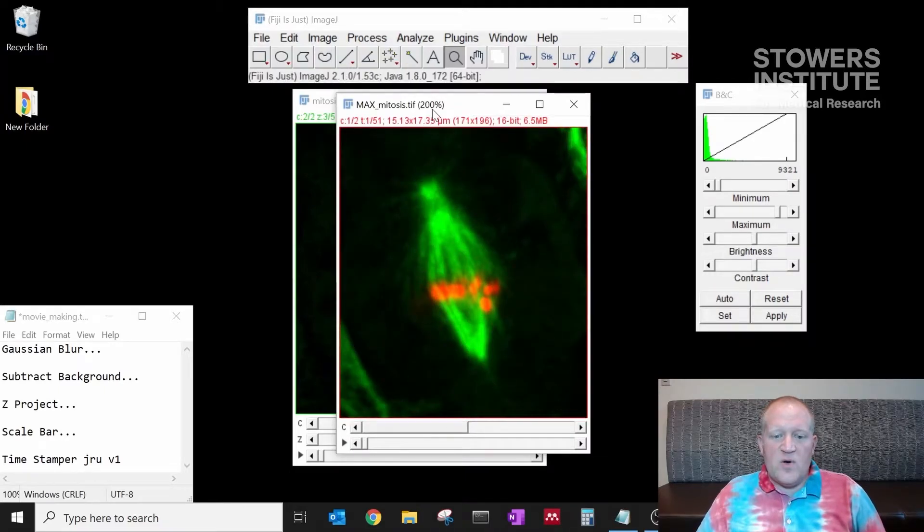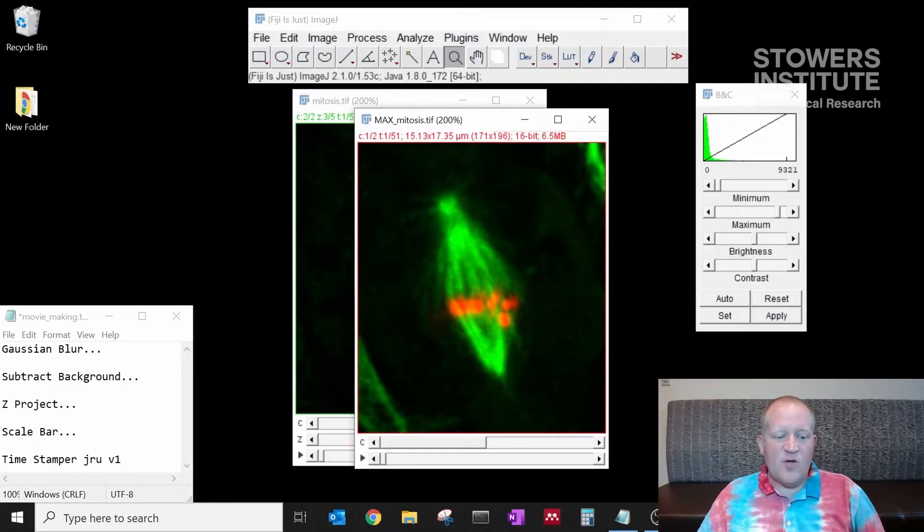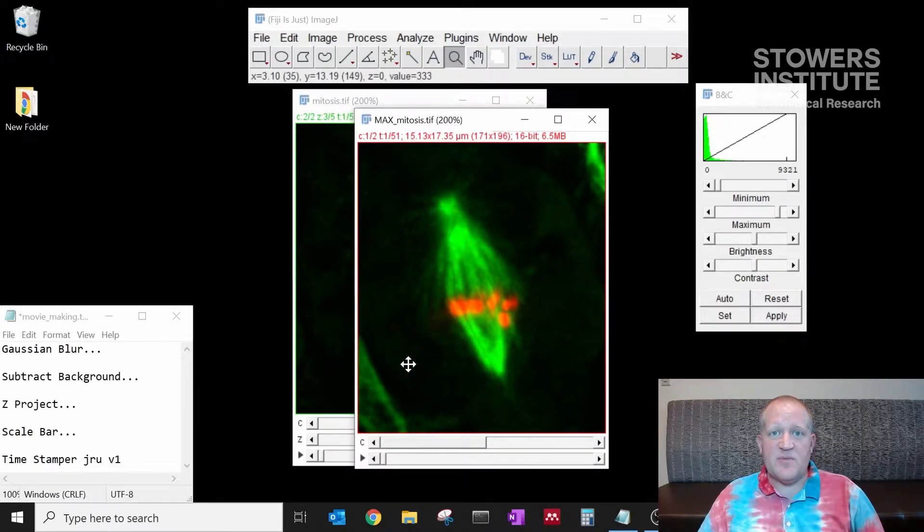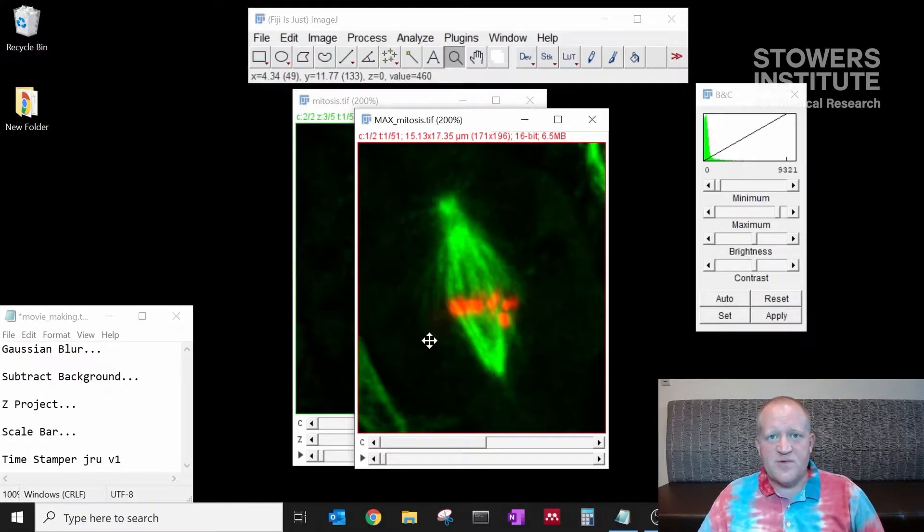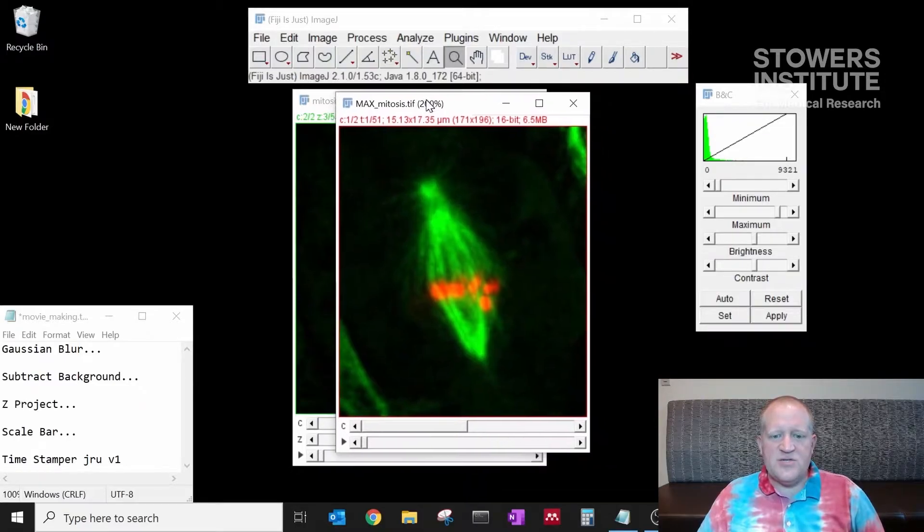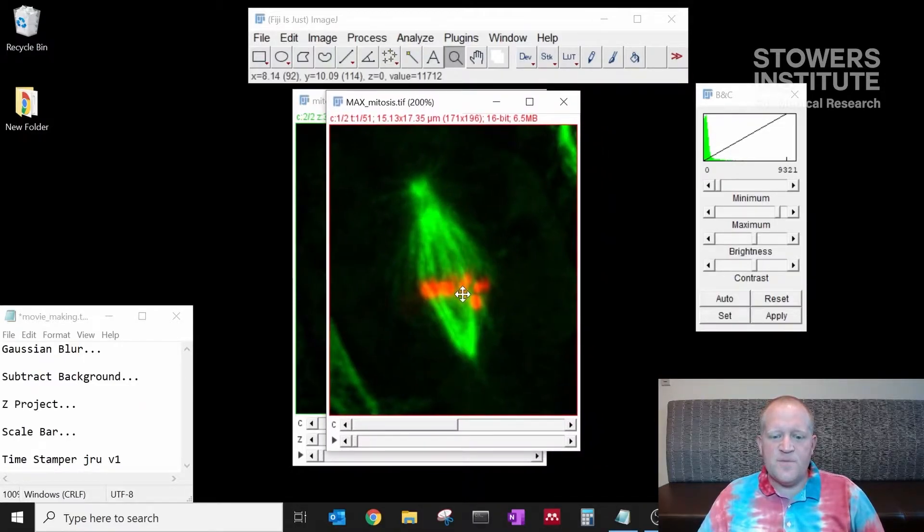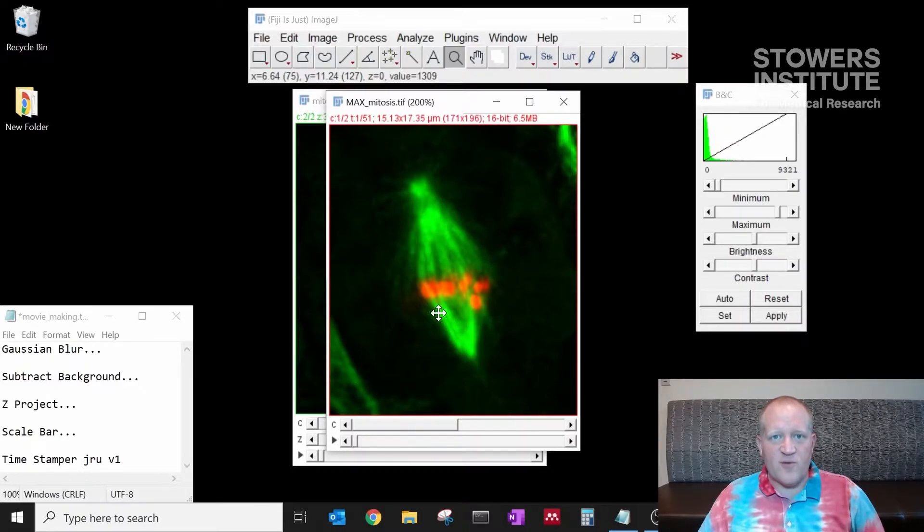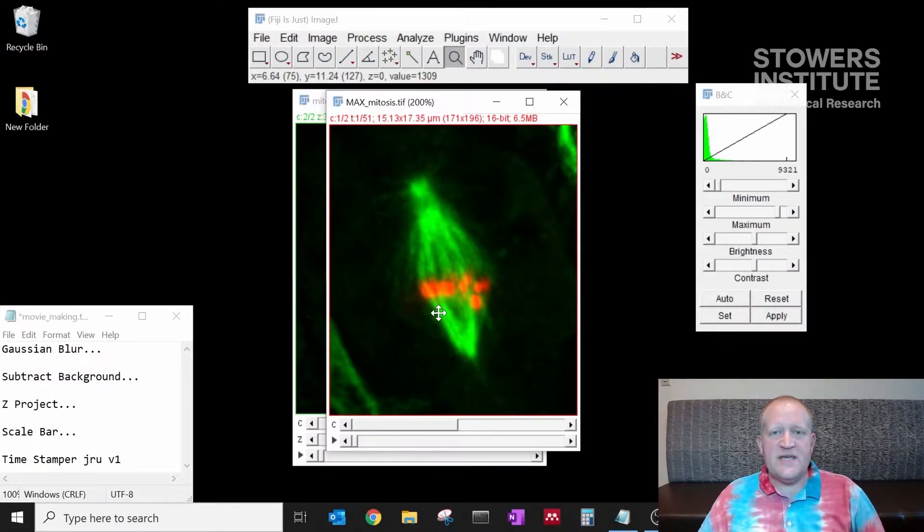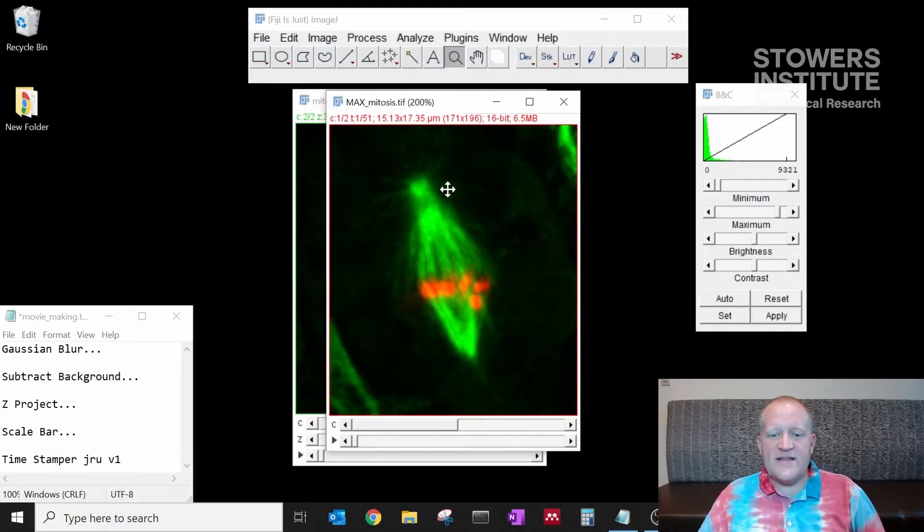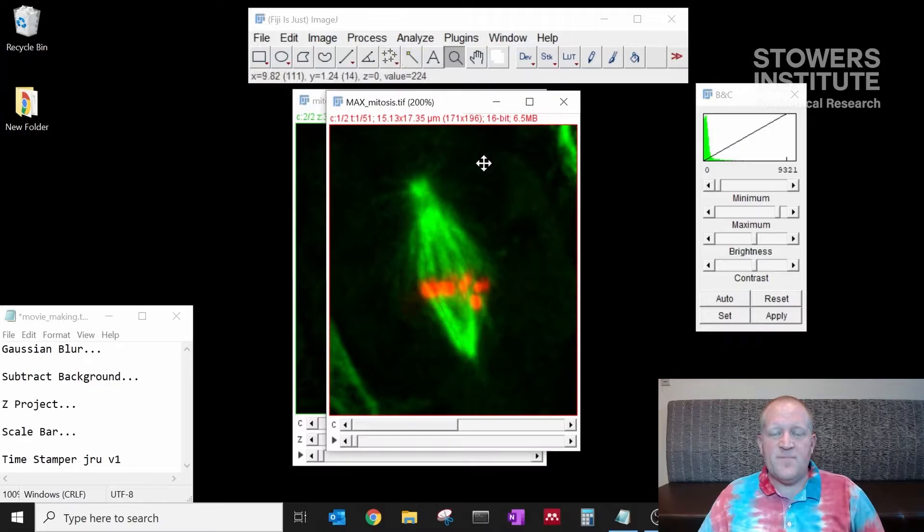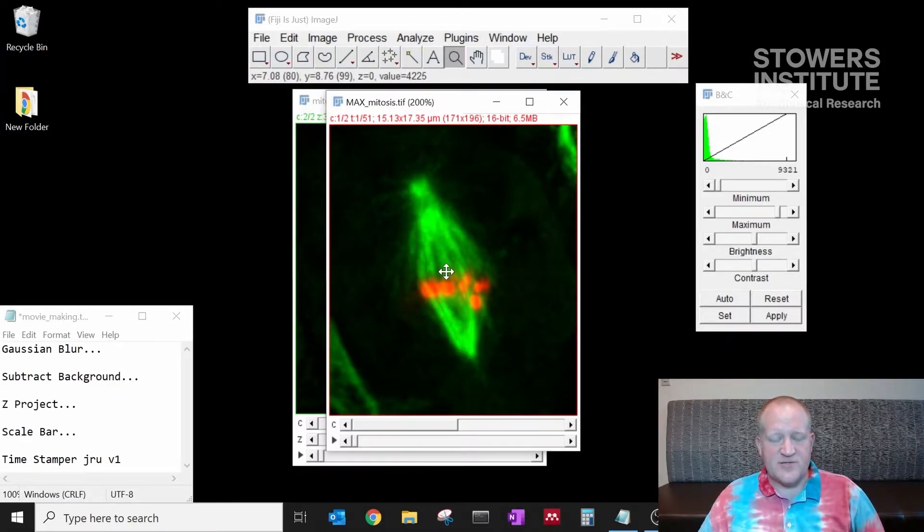Now we want to add a scale bar and a time stamp to our movie so that people know what scale our movie is on and they want to know the time over which this movie occurs. To do that the first thing we need to do is adjust our brightness and contrast settings so that we can convert to an RGB format. Because the text that we want to put onto the top of our window should be the color that we choose and if we leave it in the 16-bit format, it will add on to the green channel as green pixels or the red channel as red pixels depending on what you choose.